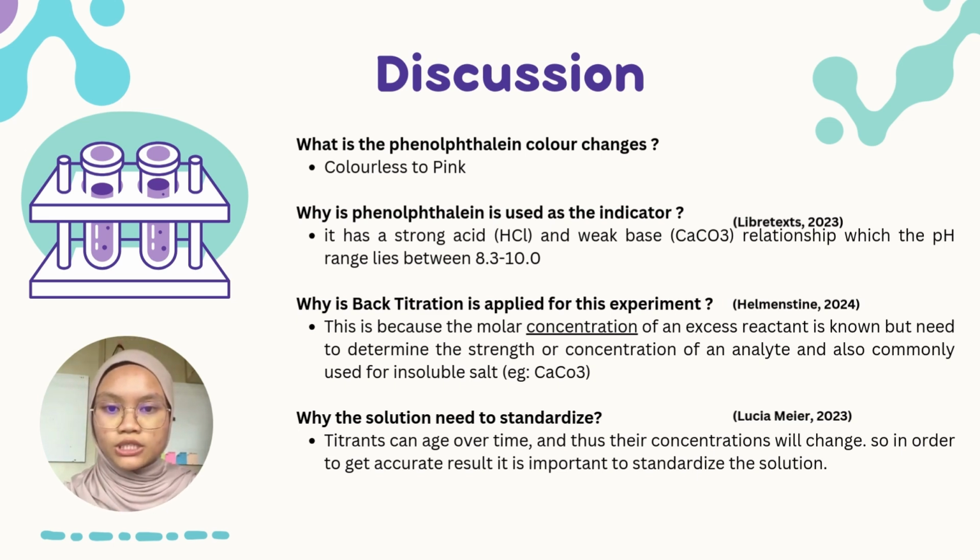Then why does the solution need to be standardized? It is because titrants can age over time and thus their concentration will change. So in order to get an accurate result, it is important to standardize the solution.